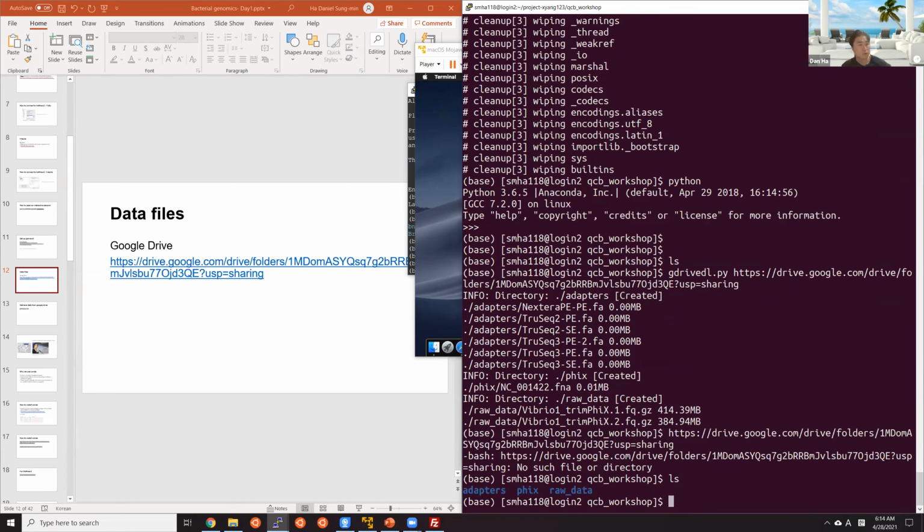Okay, so some of you have a command not found error. If you have bash properly set up, wait. What kind of trouble?